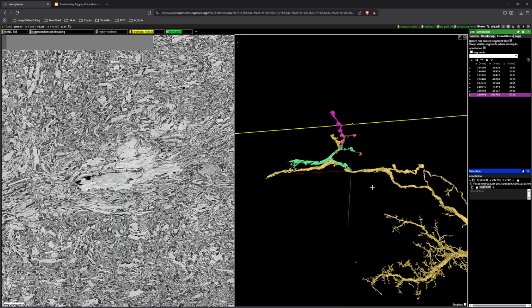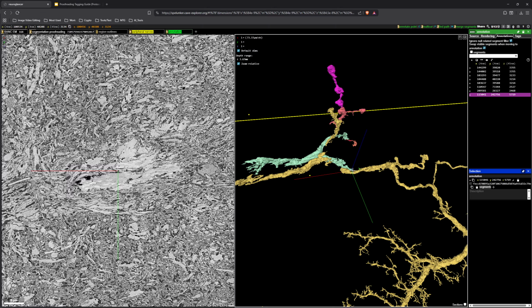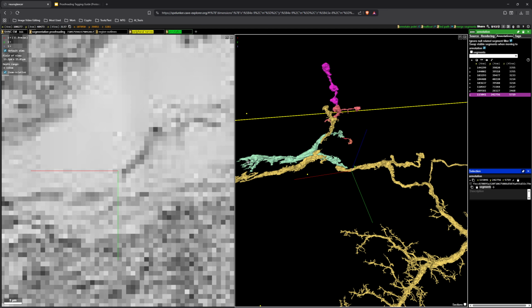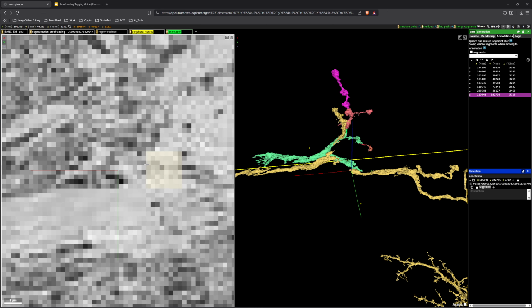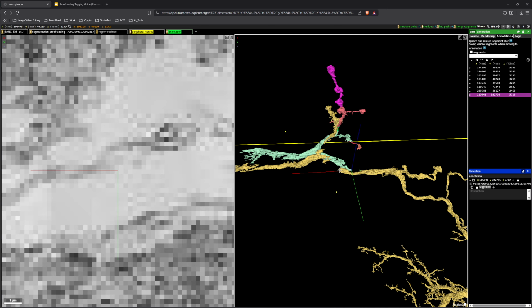And it is probably a similar cell type to this cell, but we don't have the rest of that cell. It's actually a ripped area on both sides. So luckily, the person who traced this yellow one was able to find a connection, which good on them. Excellent work. That was probably really hard.